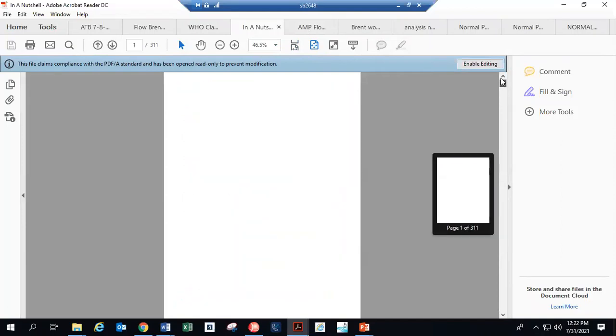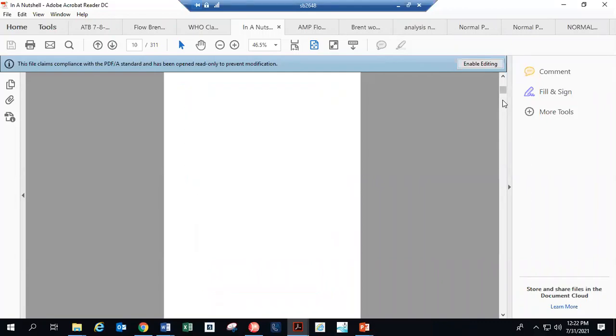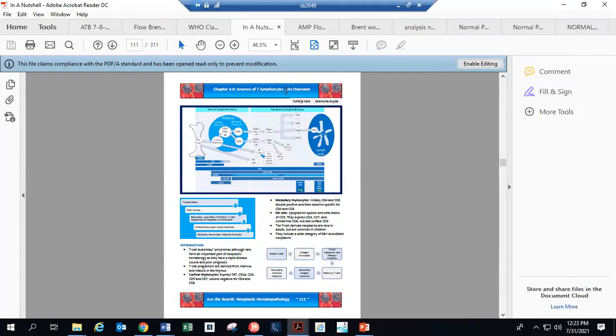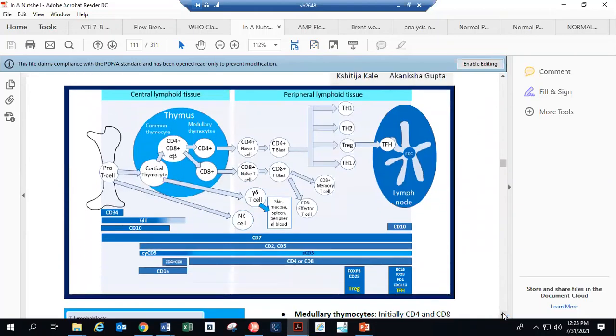I'll pull out the T here. Okay, so this is the T, and I think we didn't do this one yesterday. So let's quickly go to the T one.